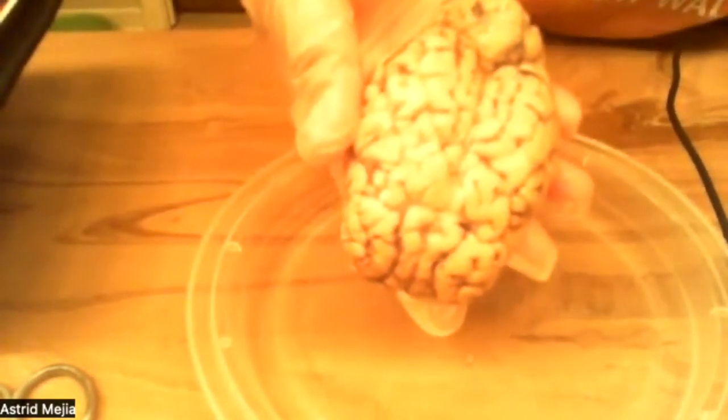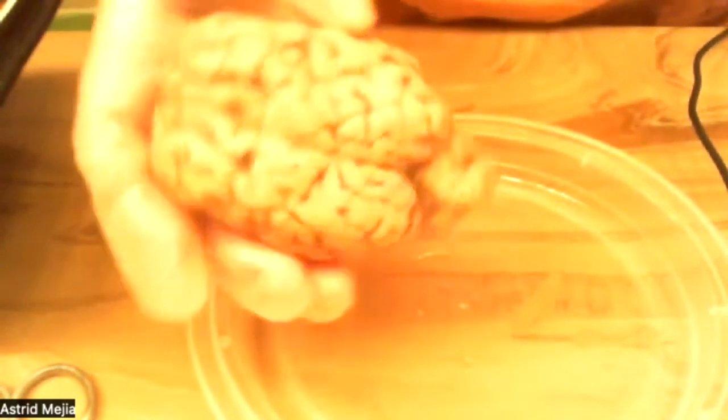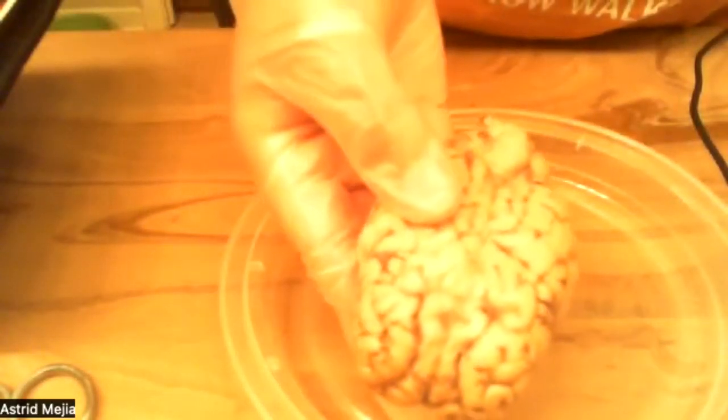And then another structure that we can see here is the cerebellum, the bottom right here. And that is basically known as the little brain as well. And it controls balance, coordination, movement, and motor skills.